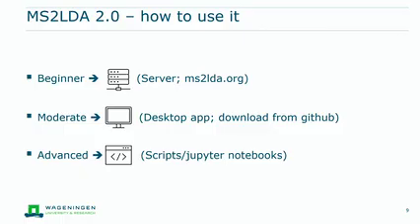Let's start with how you could use MS2LDA, and there are basically three options. There's the beginner one, so if you have no experience at all with Python, then you can use a server. The second and third option are really similar, and today we will only focus on the second one, and that's also the first part of what we are going to do. It is by far the most challenging thing to get software running in general. So we will spend now a fair amount, maybe 15-20 minutes, on trying to install MS2LDA on your laptops. Can I see a show of hands of who has Python and Conda installed on their laptops?